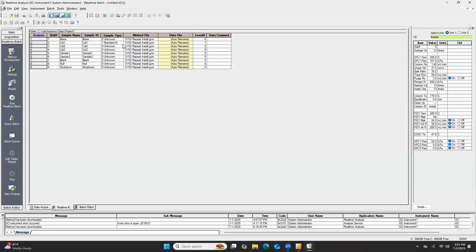But yeah, going back to the batch table. The first calibration curve is the only one that needs the initialize, and you see it by the parentheses, capital. For calibration curve number 2, still do a similar step where we change it from unknown to standard, but here we'll keep this middle button selected where it says just add calibration. So now it still says standard, but there's no parentheses. So now we know that all 3 of those standards are good.